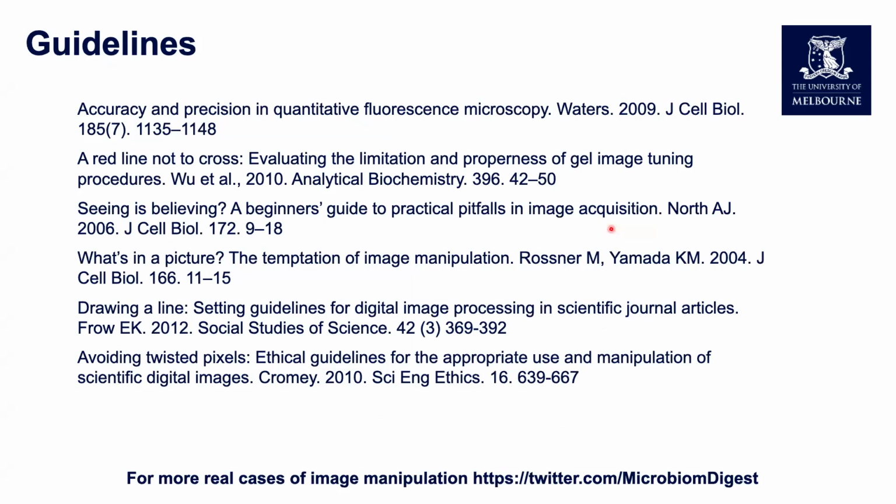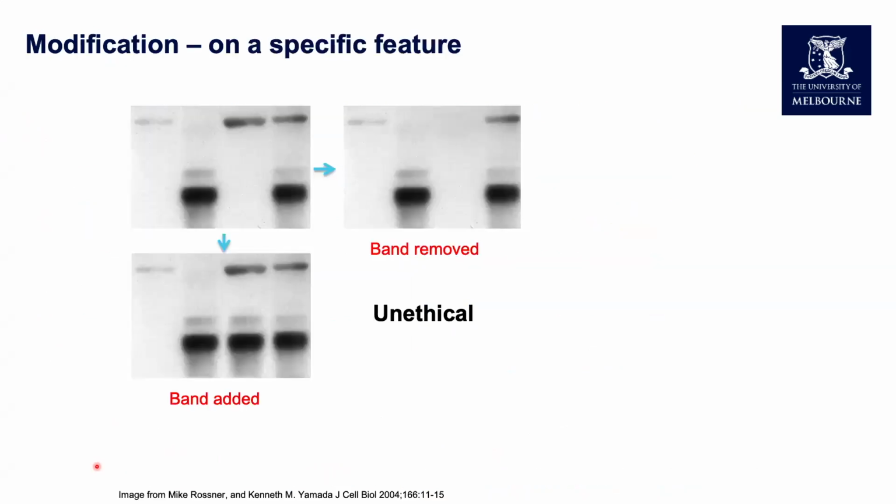So there are a number of resources available to you. There's a number of papers which I've included here, which give some guidelines on that. If you want to see real-life cases of image manipulation, then you can go to this Twitter page and follow along with real-life modifications. Okay, so what we're going to do is go through some of the examples, and I'll explain to you why these are good or not.